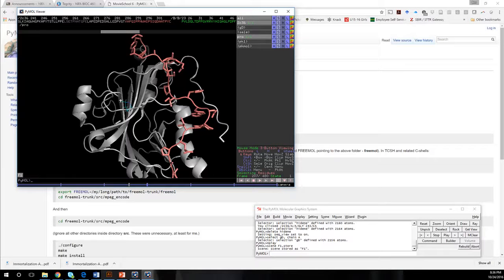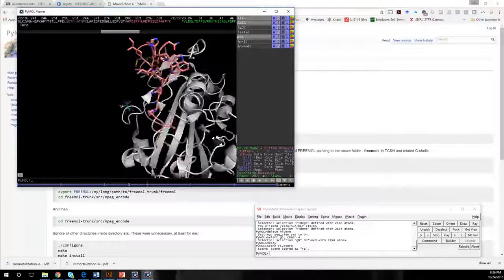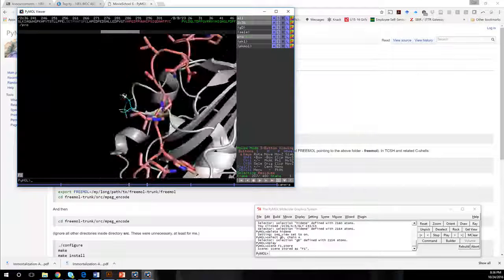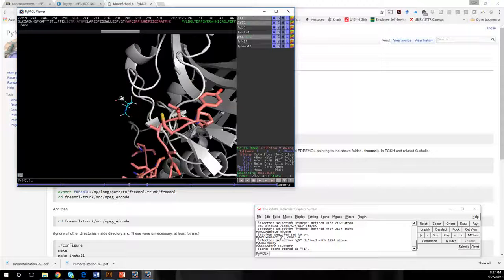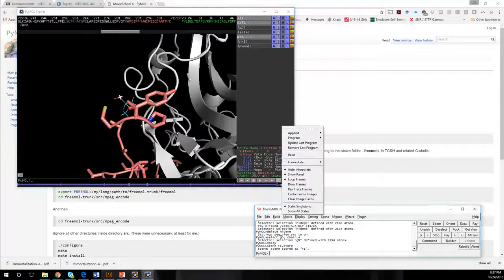And then let's color those by elements, so that you can actually see, just like you would on the test, exactly kind of what it looks like. And then let's pick somewhere to zoom that might have some interesting features. Looks like there's a pretty, well, I was going to say it's hydrophobic, but that's not overly true there. Well, there's a sulfur interacting. So let's zoom in on this right here. So now I'm going to go to movie. Oh, sorry.